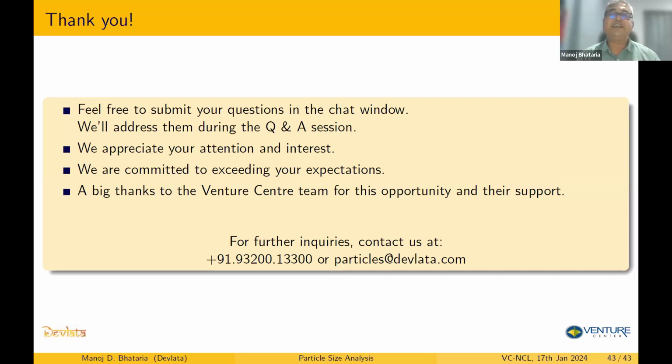See, the theory says that there should be only one particle in suspension. I mean, there should not be any particle-to-particle interaction. That is how the theory goes. Now, with another particle in the suspension, there is going to be some interaction. So a reasonable method to know that there is no interaction between two particles in the same suspension is if the distance between two particles is greater than, let's say, 20 times the diameter. Now, this is a thumb rule. There's nothing exact in this. So we assume that if the distance between two particles is greater than 20 times their diameter, then they are not going to interact with each other.